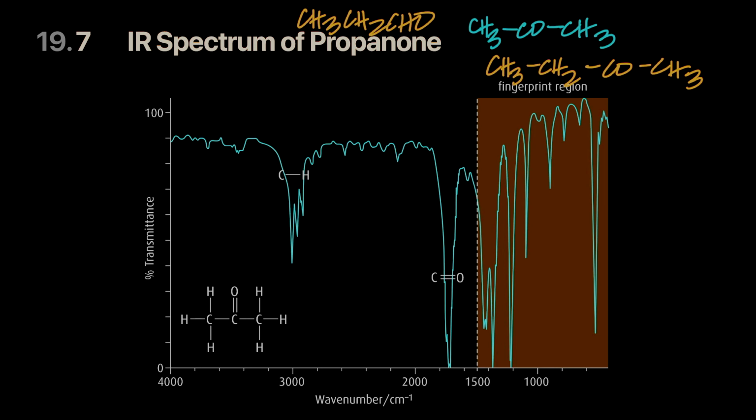All right. Let me repeat what I was saying. So the fingerprint region will be able to help us identify each unknown sample's graph to exactly what the molecule is. But for that, we'll have to use a computer. It will not need your and my deduction. What we are going to be concerned with is only and only the region after the fingerprint. Because below the fingerprint, there's no science involved, right? Because the only one molecule that will have this exact same graph will be propanone.